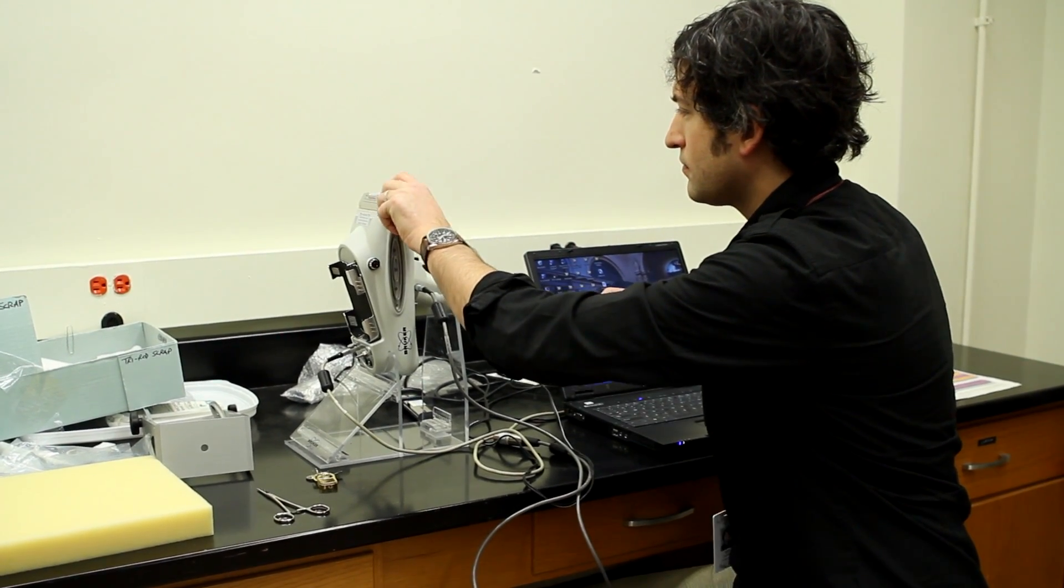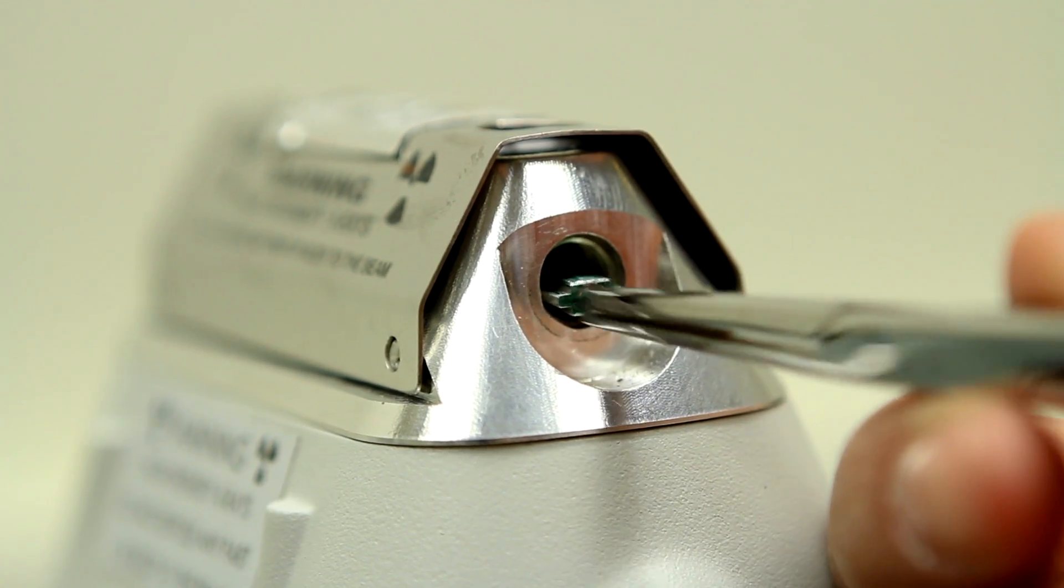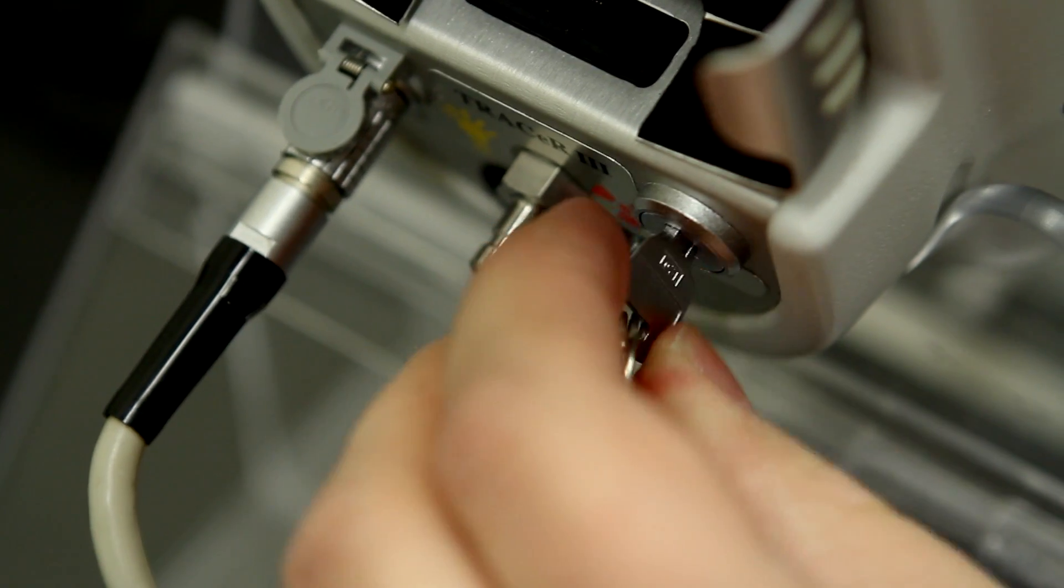So this is a portable x-ray fluorescence spectrometer which we use to measure the chemical composition of objects here at the museum.